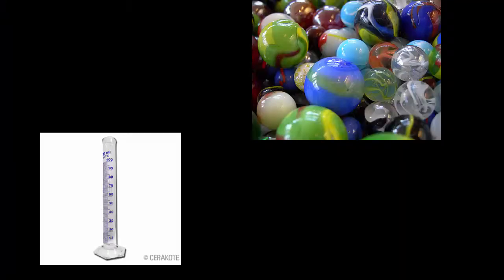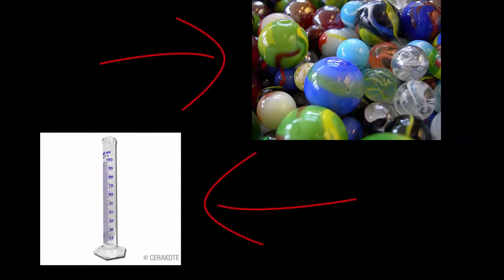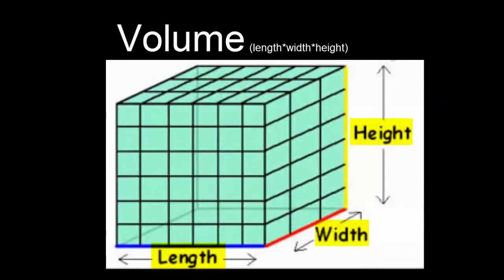Today we are going to show you how to measure the volume of an irregular shaped solid using a graduated cylinder.